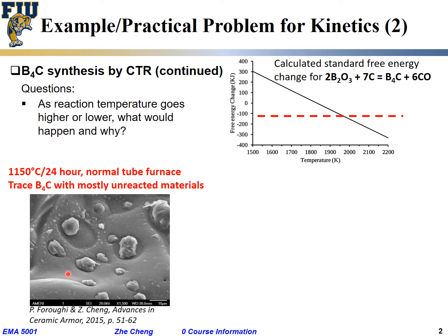That gives you this smooth feature. But out of it, like potatoes growing out, like carrots growing out, we have some highly crystalline crystals. But it's occasional. As a result, our X-ray doesn't show much boron carbide. Make sense? This is what we got when we further decreased the temperature.